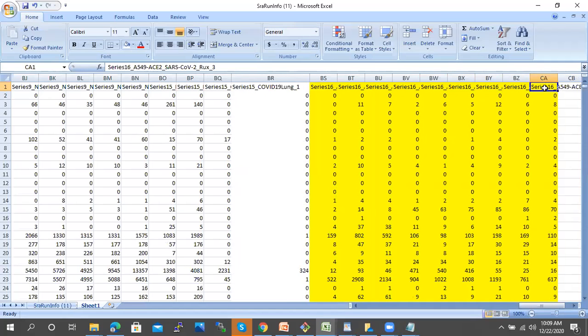I have taken this data and made a new data set, removing all those genes having zero value across all the samples, so I have considered only important genes. Finally, I am able to produce a gene expression table having these three types of sample: mock treated, which is a kind of placebo, untreated samples, and three samples treated with ruxolitinib.